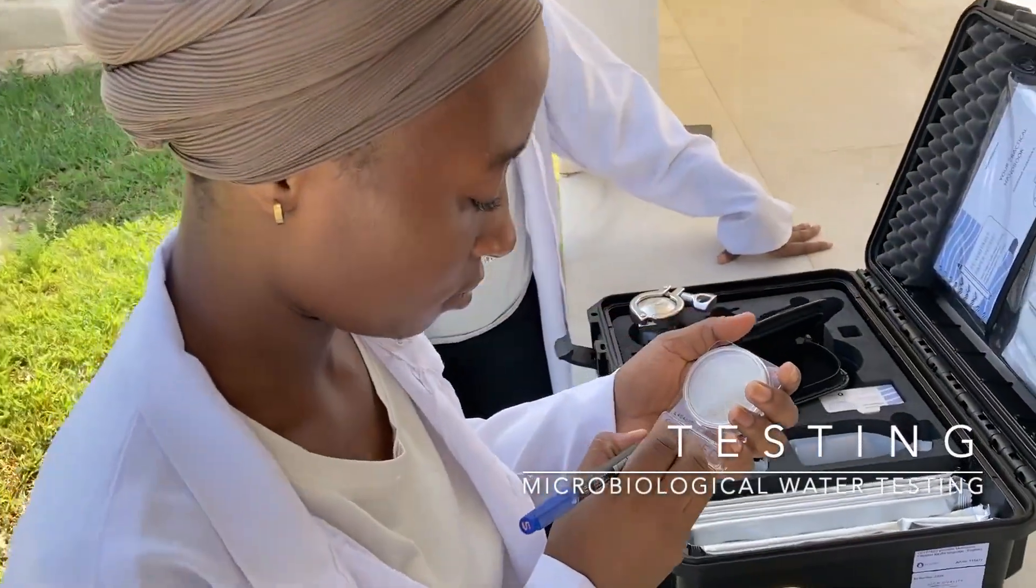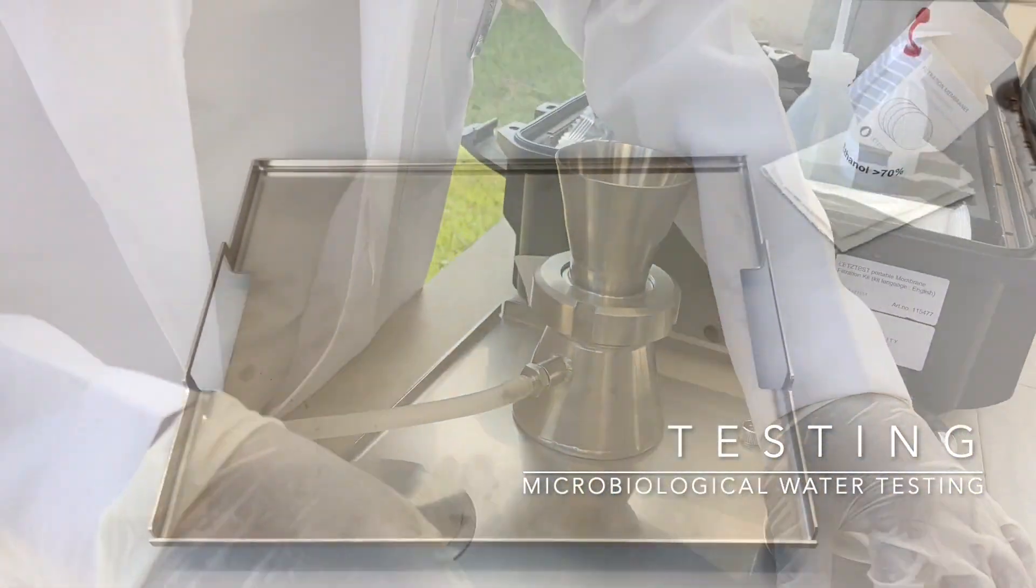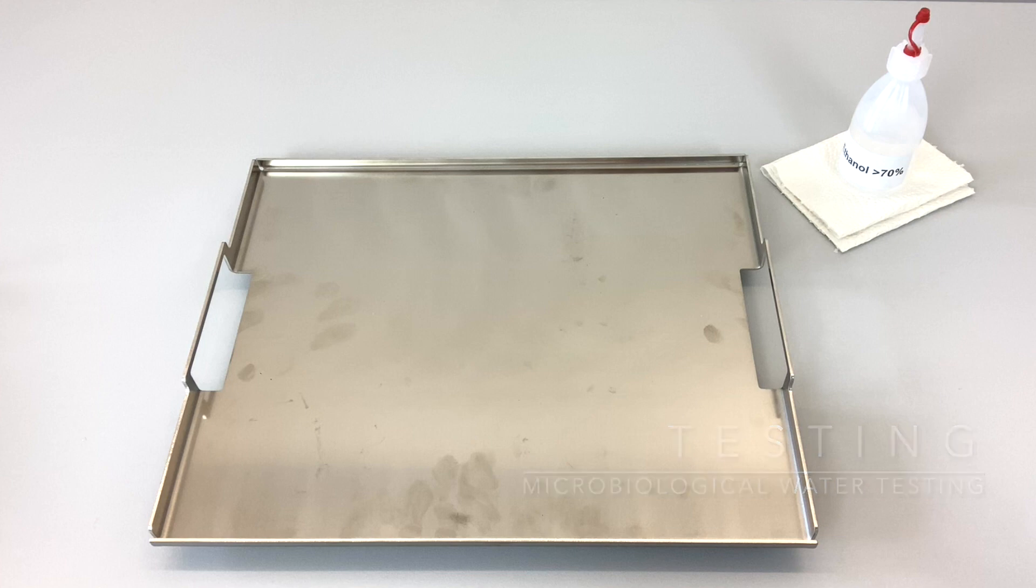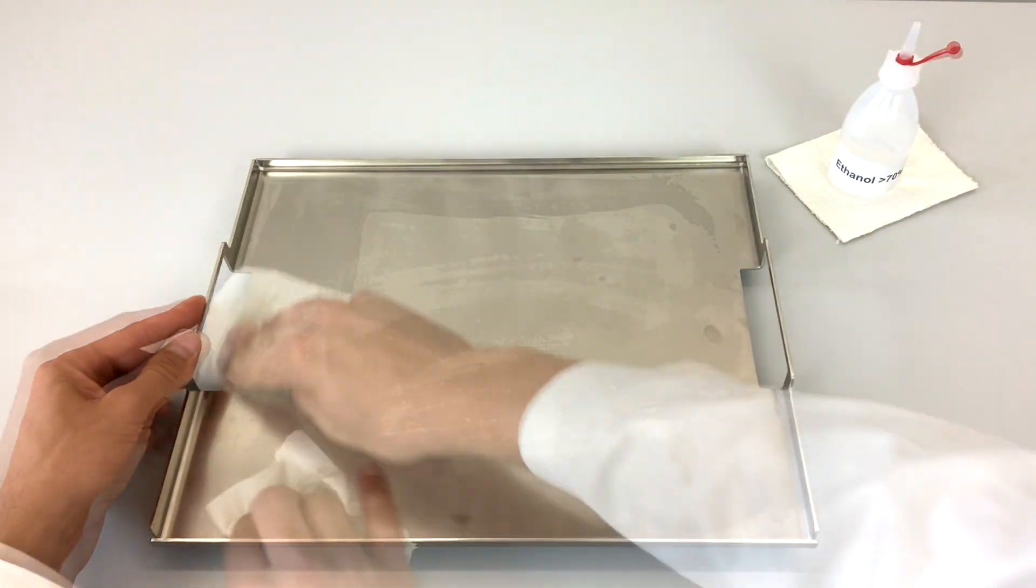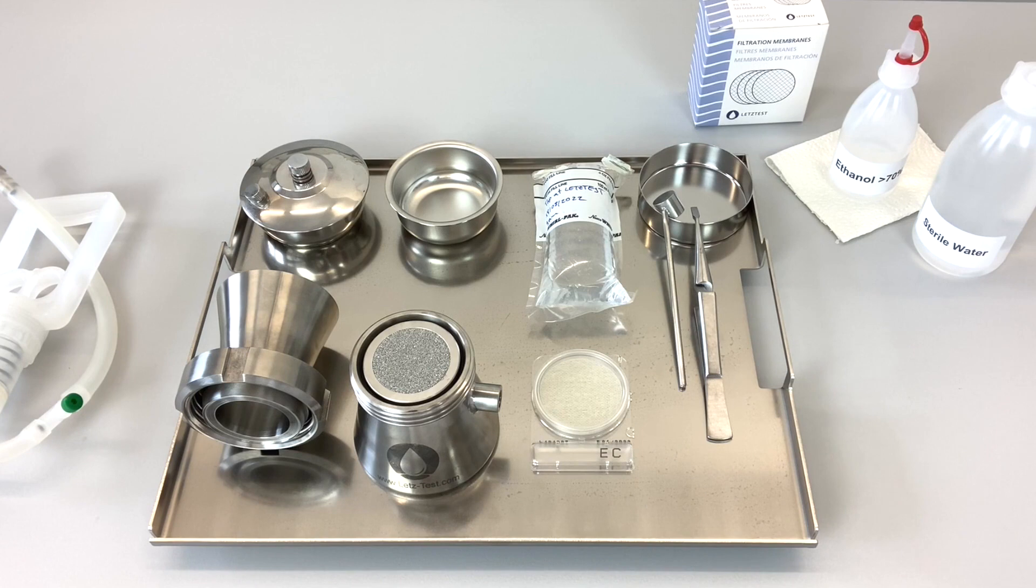Once the water samples have arrived at the central location for testing, set up the work area. Use the portable lab bench if you do not have a flat and easily sterilized work surface. Disinfect your hands and the work surface with alcohol, then set up the test equipment.